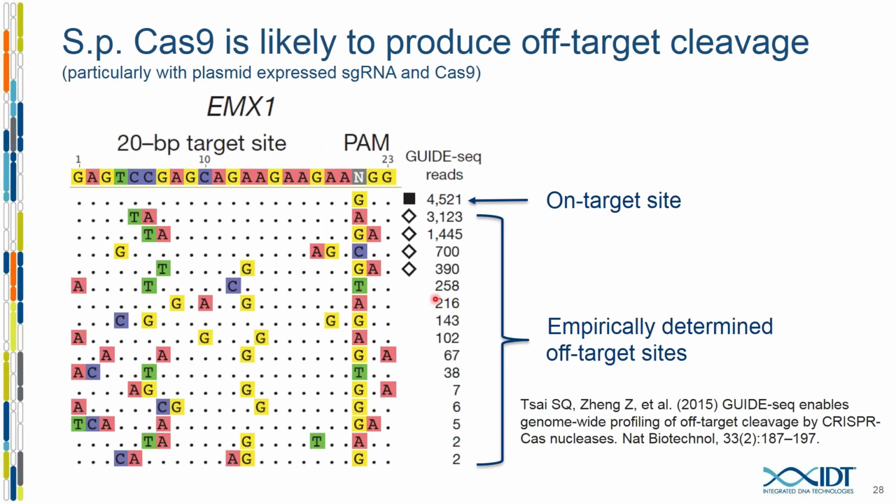We thought this was really putting the protein through the ringer, but ultimately we should look at this in cells. The best way to do that so far is with the GuideSeq approach. What we found is that GuideSeq does a fantastic job of identifying what the off-target sites are for a given guide, but where we struggle to use it in-house is in giving quantitation to these numbers. We don't find these numbers very quantitative when we assess them with PCR amplification-based techniques.